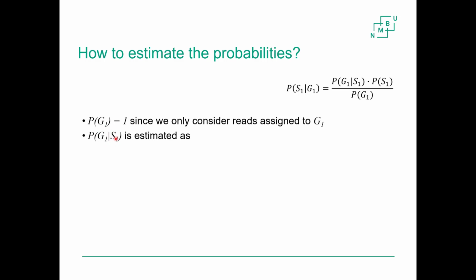And how do we estimate it? How does Bracken estimate it? Bracken does it like this. Collect all possible reads of length r from this species. So it dives into the Kraken database, collects the genome that is in the database, and then cuts it into reads of length r.